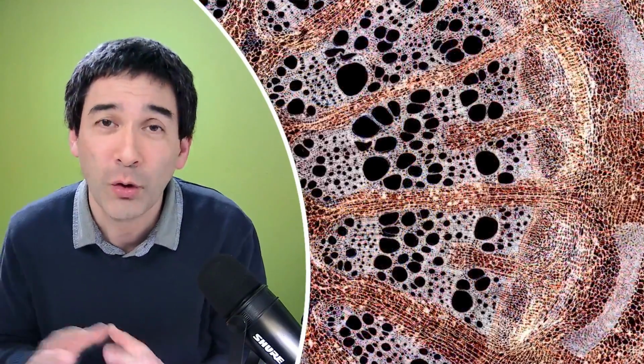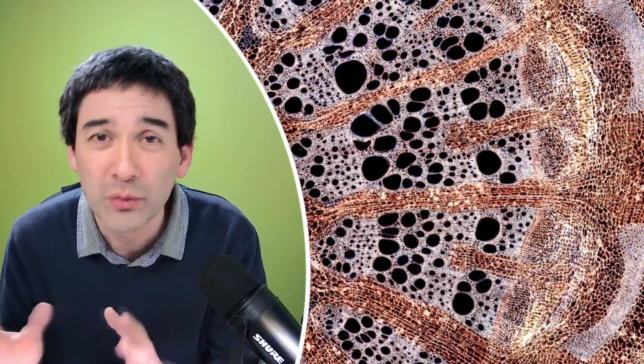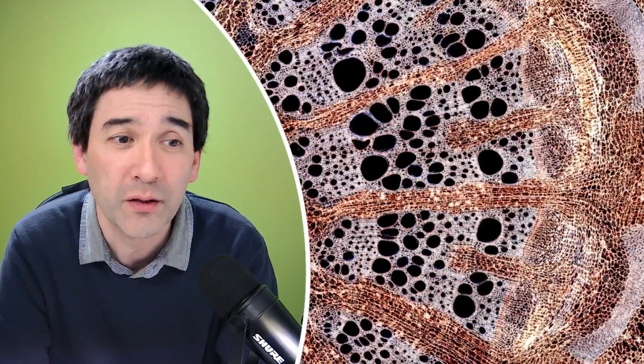I can also tell you that many of the things that we've seen there are not bacteria. There are, of course, bacteria present as well in the sample, but those that you've seen there were not bacteria because I used a very low magnification, and bacteria generally are significantly smaller, and you need a higher magnification to properly see them, right? So you can already see that just by the overall size, I can already narrow down a little bit into which direction it's going, right?